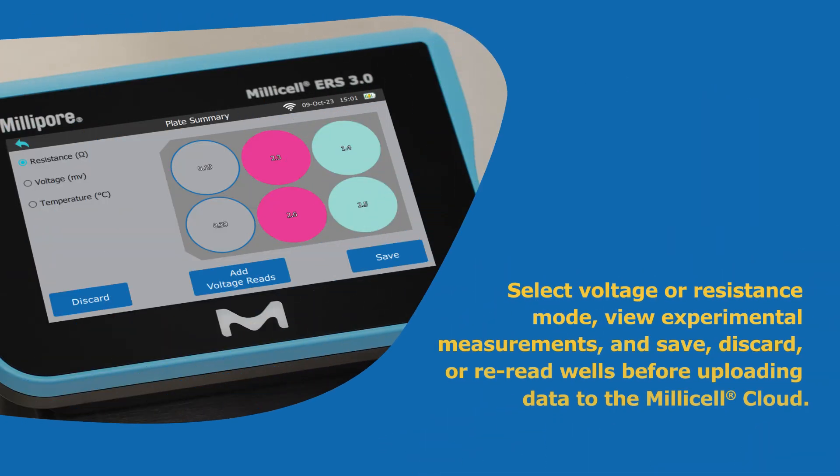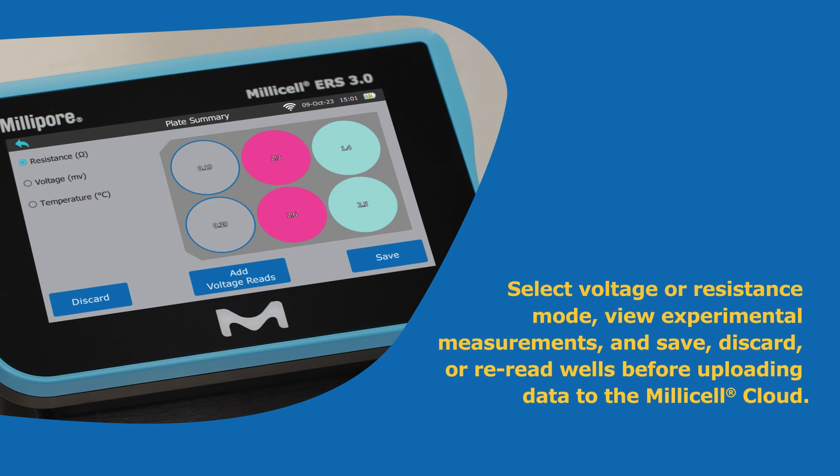Select voltage or resistance mode, view measurements in real-time, and save, discard, or remeasure wells.